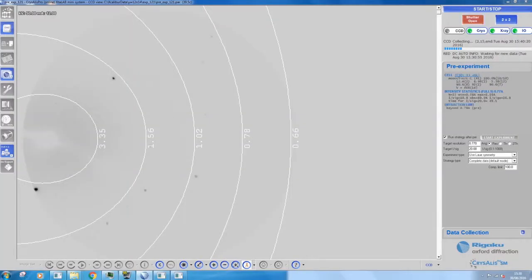Once a suitable crystal has been found, a pre-experiment is run. A total of 15 diffraction images are collected in three different orientations to determine the best full data collection strategy for the sample. This allows for a more accurate determination of the symmetry and the unit cell parameters of the sample. If the diffraction pattern seems okay but it is not diffracting to the higher angles, it is worth increasing the exposure time and performing another pre-experiment.